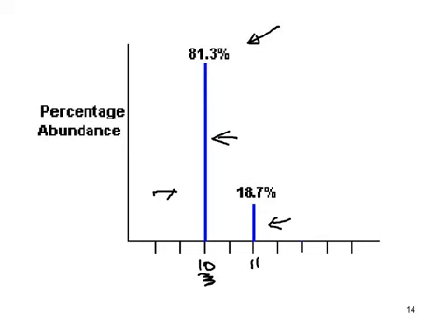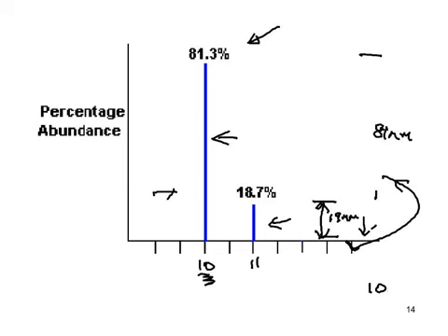But let's go back to how we interpret this. If you were to take out a millimeter ruler, should this be on a page in front of you, and you measured the height of this particular line and did the same for this other line, and let us say, for the sake of simplicity, that this came out as 81 millimeters, and this came out as, again for simplicity, 19 millimeters. You notice that the 2 sum up to 100 millimeters, 81 and 19.